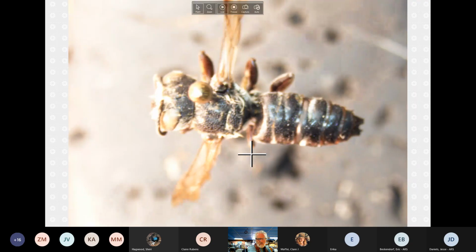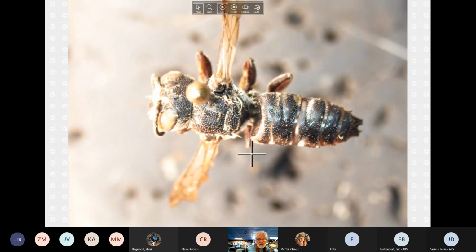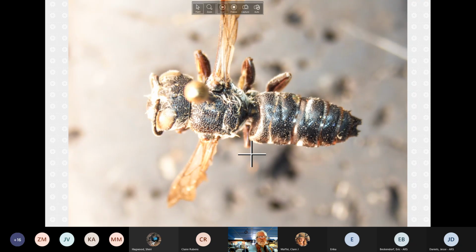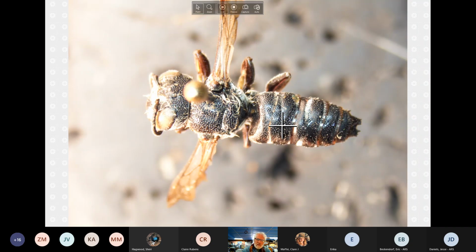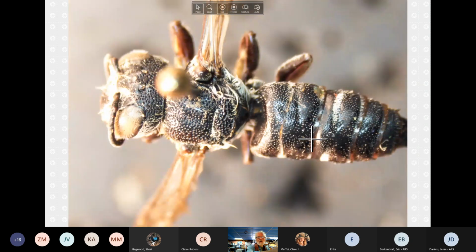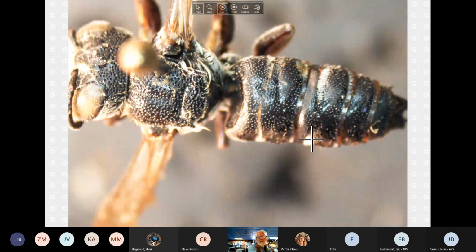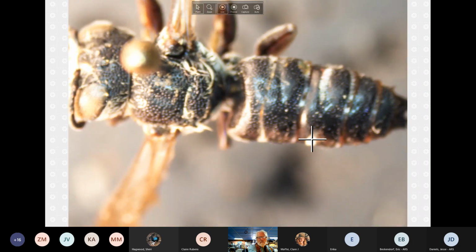So if we look at this, you can see in this particular case, if we were to key this out completely, the central grooves disappear in T2 and T3, or it looks like largely on T3. Oh no, this is T2, this is T3, but the grooves in the center are pretty much gone. Get that in focus.